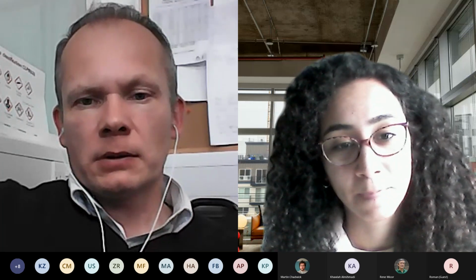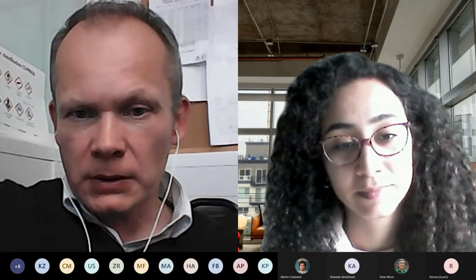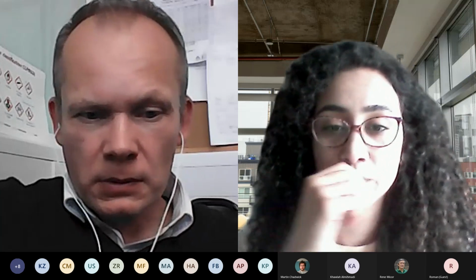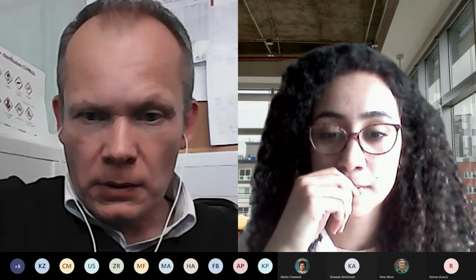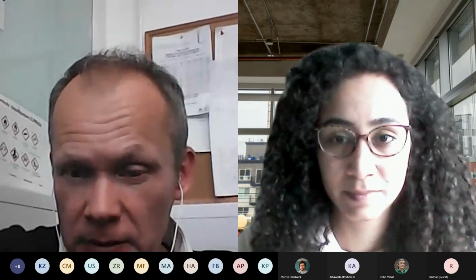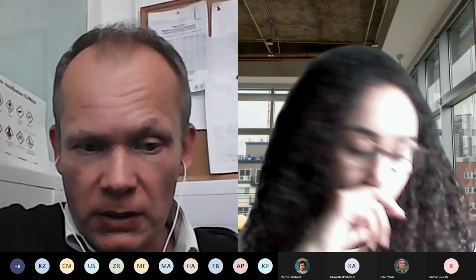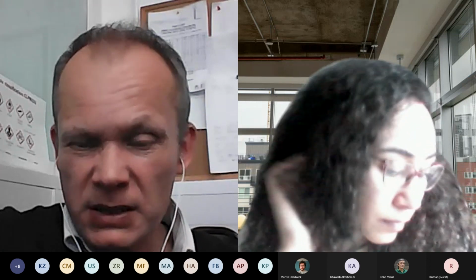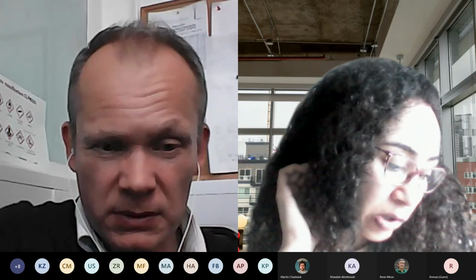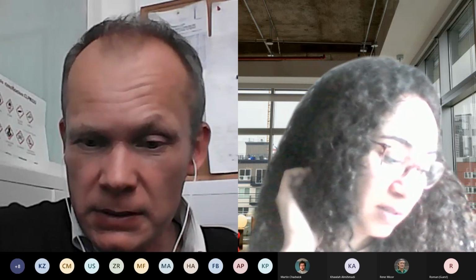Sure. Well, I will type my email in the chat. But again, dynamic light scattering works with nanoparticles, from 1 nanometer up to 1 micron. Micro-sized particles are not a good system for DLS.